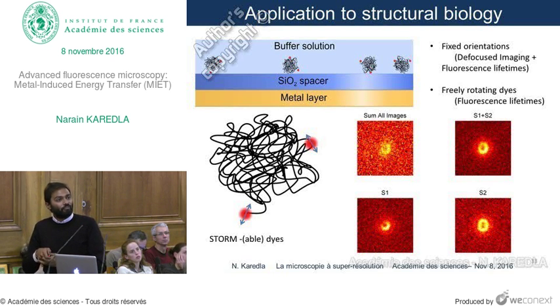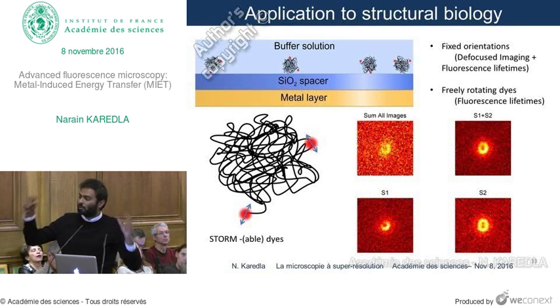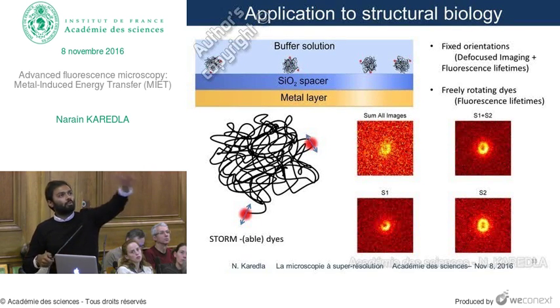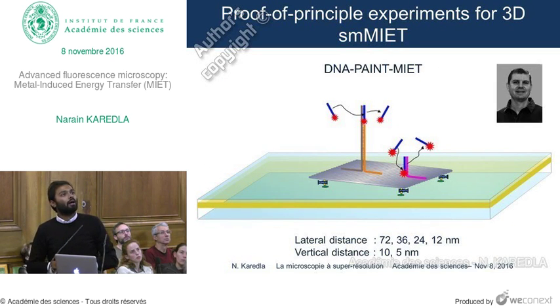You can then fit for the orientations of the 2 dye molecules, get the XY position, get the orientations, and then use the lifetime information to get the Z. In this way, you get the 3-dimensional positions of both molecules, and you can estimate the distance. You will do that on multiple molecules, and get a distribution of the distance between the 2 sites of your interest. We are now designing some probes with the help of our postdoc, Roman Sukarno.